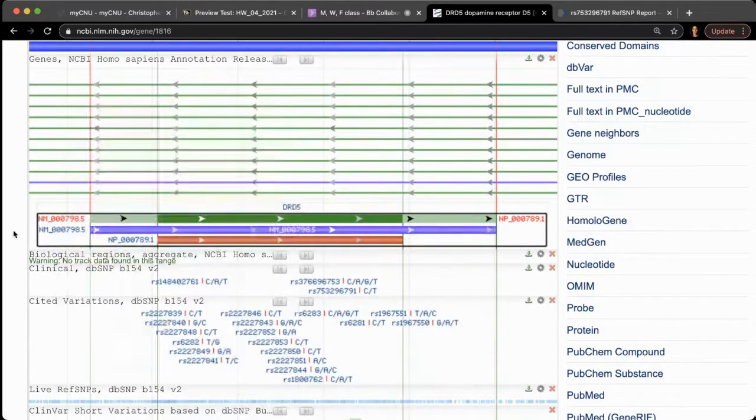This part here is the part that is the mRNA that is produced. So remember that the gene is the DNA sequence that is transcribed. So that green sequence gets transcribed, makes this molecule of mRNA, and out of this whole mRNA, only this chunk is going to be translated.